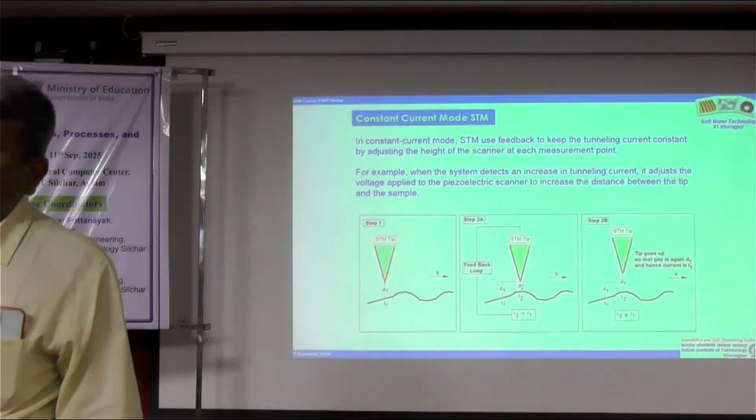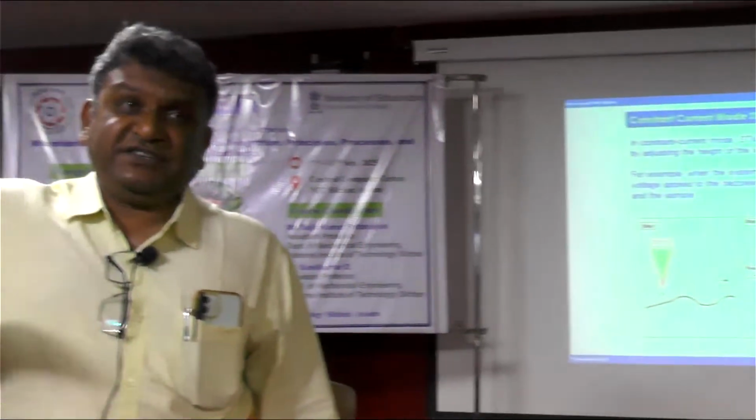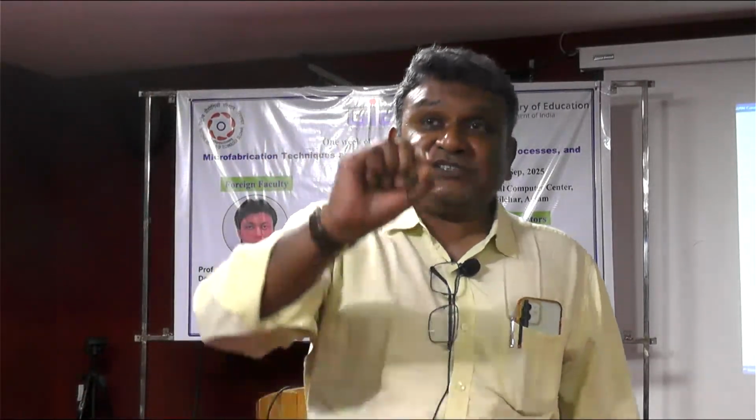It is actually digitally recreating the contour of a surface, right? So you know how much higher or lower the features are at a particular location, which otherwise in a microscope, you will capture some image and based on the contrast, our perception that anything that is brighter is closer to us, anything that is darker is below, we sort of create a mental map.